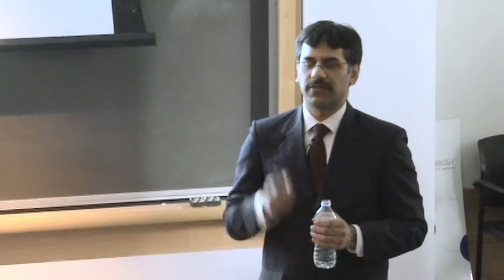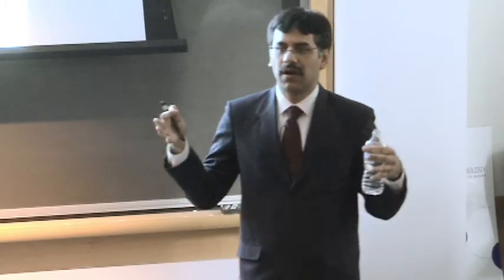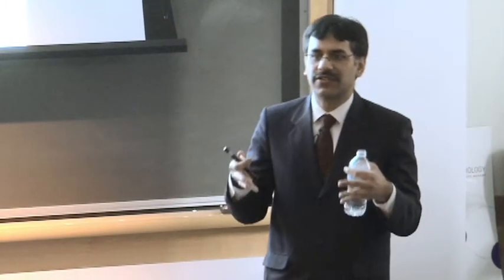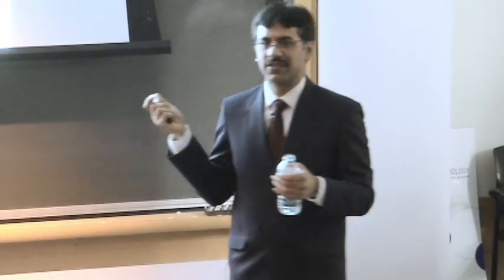So we haven't done much work in that direction, but there are a couple of things. One is that there is a huge effort in terms of standardization in the proteomics community. For all these different kinds of things that we observe in mass spectrometry data, there are standards in terms of how you address each peak, how you address a mass spectrum. So our goal is eventually to incorporate all those standards in our application.